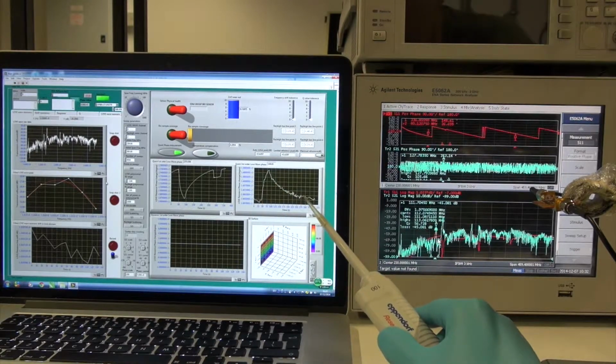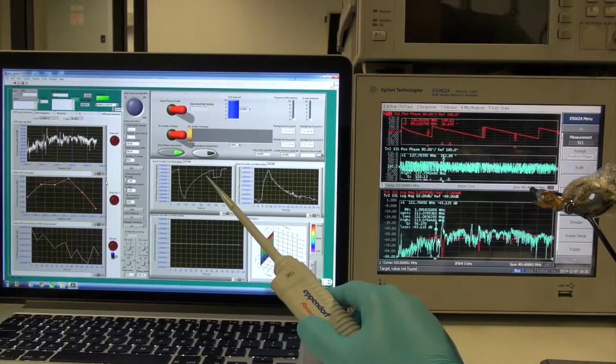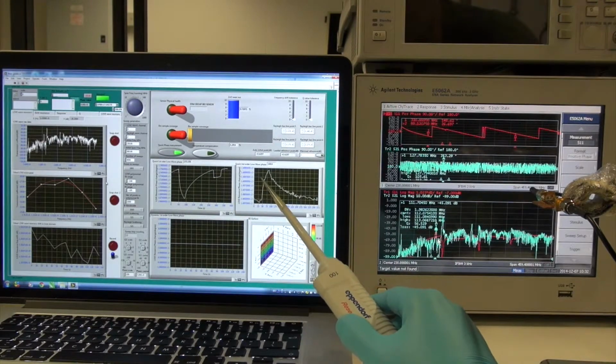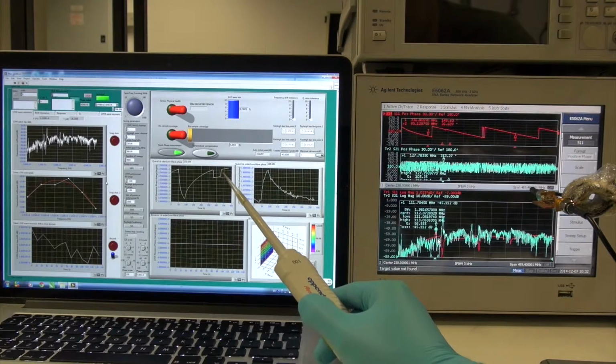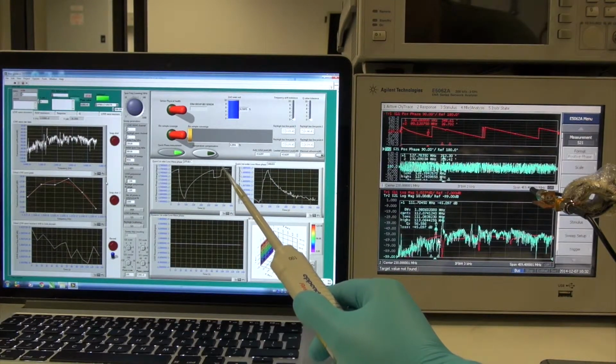But on the third order, we can't see any change during the mass change. So by simply subtracting the first order Love wave resonance from the third order Love wave reflection coefficient resonance, now we can get a purified mass change signal only here.